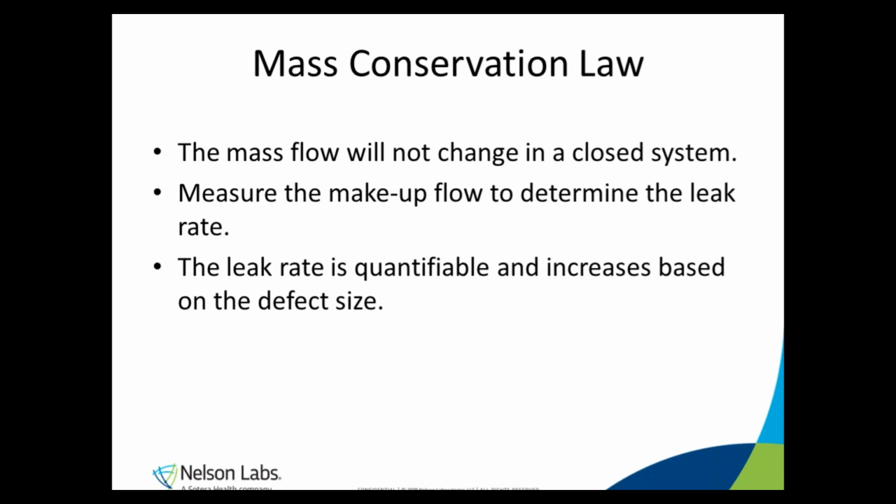Mass extraction is based on the mass conservation law. This law states that the mass flow will not change in a closed system. If you measure the makeup air required to hold a vacuum in a closed system, then that equates to the leak rate. The leak rate is quantifiable and it correlates to the defect size. So if I have a smaller leak rate, then I have a smaller defect. A larger leak rate would be a larger defect.